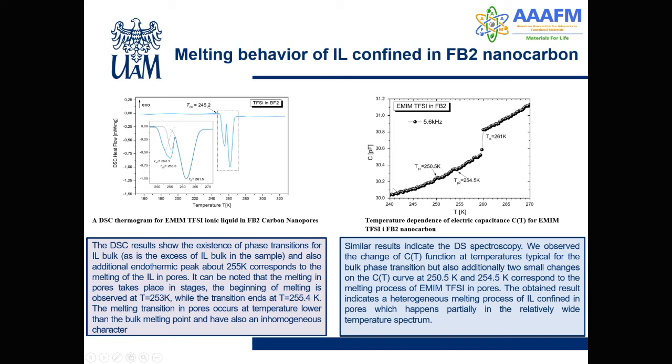Similar results we can see from measurements of dielectric capacity. We can see two points of change of the capacity related with the pore melting, and a big change of the capacity related with the melting of the bulk substances.